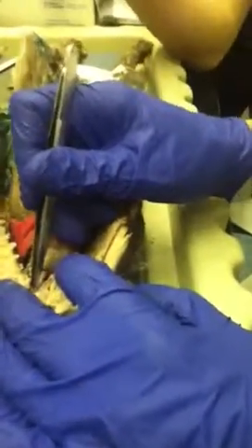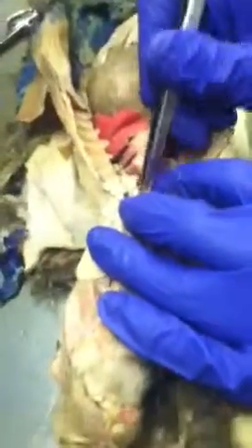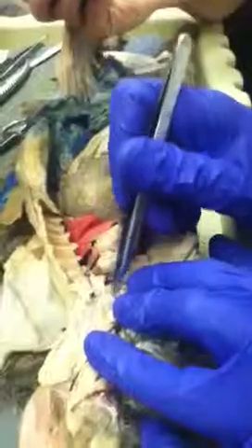Okay. So here's a short little trunk that gives a branch to the left and to the right, and off the right side, yeah, where is it? I want to see, there should be a branch into the right arm, shouldn't there?